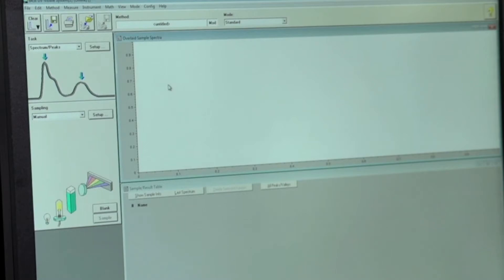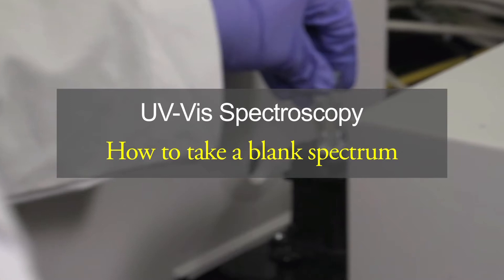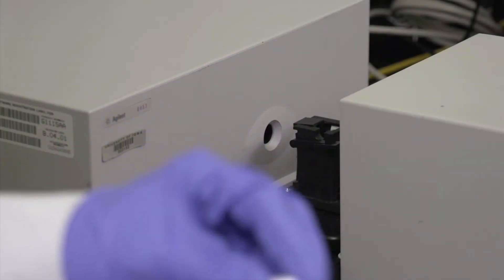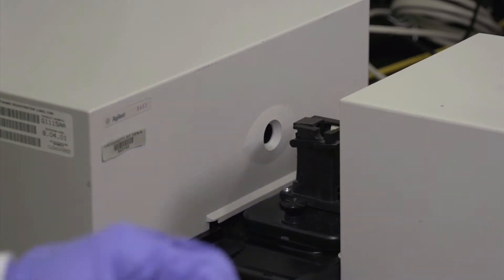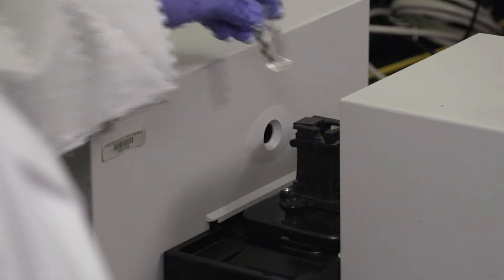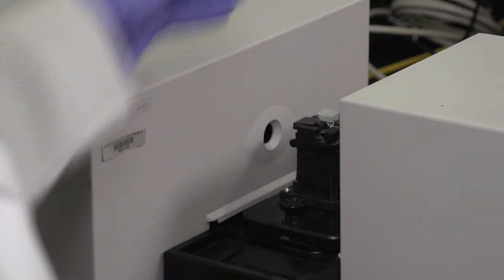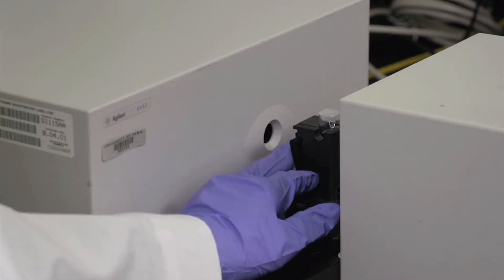Now we're ready to take the blank spectrum. Fill the cuvette with double distilled water for the background. And it should be about two thirds of the way full. And then we're ready to place it in the sample compartment. So ensure that the arm is up so that you can put the cuvette in the compartment. And then place the cuvette in and press the arm down to lock it into place. Now we're ready to take the blank spectrum.